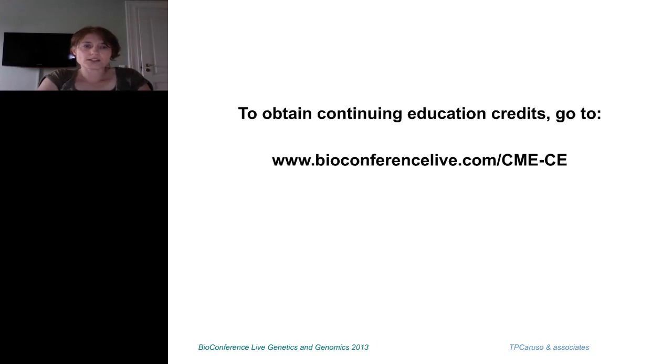The second question here is, could you please highlight cost comparison also? So, the cost, if you want to buy the microarray sequencing assays, those were varying depending on which assay you were looking at. I don't want to lie here, I would say from about $200 per assay upwards.